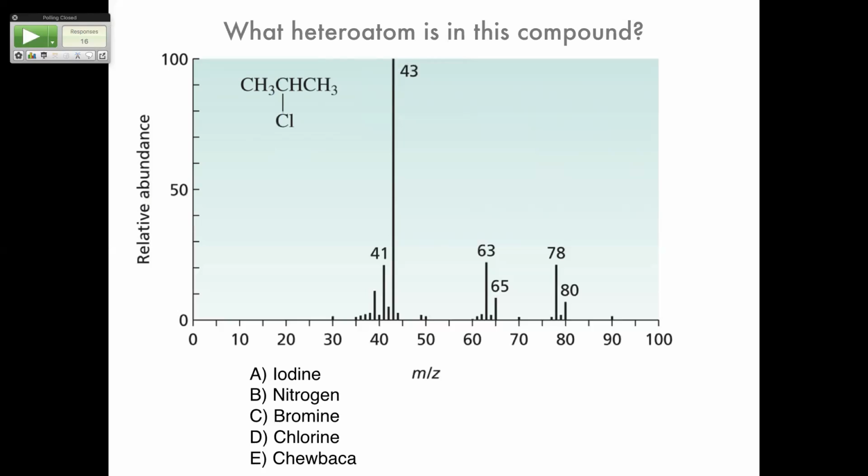Because there's only 3 carbons, okay? If you get to 4 carbons and 5 carbons, it gets bigger, okay? Do you think you could tell those two apart on the proton NMR? What would the top one look like in the NMR? What would you have? This would be a, what splitting? Triplet.